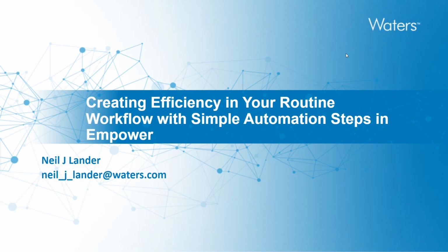So as the title indicates, how can we streamline the workflow in the quality control laboratory to help reduce risk? If we can automate things as much as possible and eliminate some of the human intervention, we can reduce the chance that errors may be made. Now, it's really two things. It's developing a streamlined SOP, but also then taking advantage of the tools within the software to make this streamlined SOP translate into a streamlined actual working process in the laboratory.